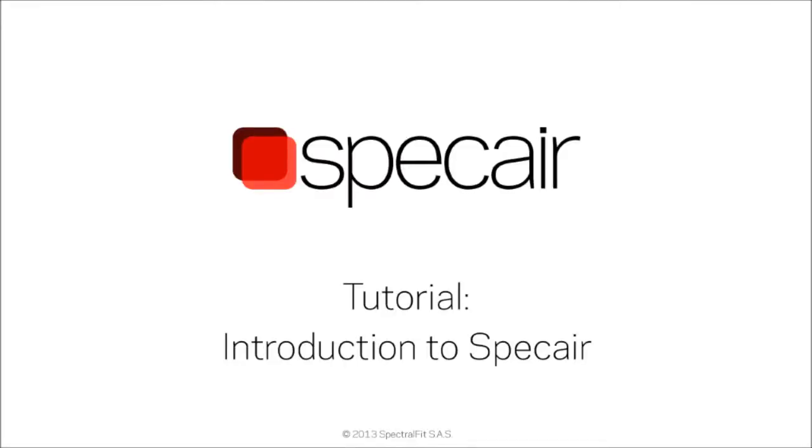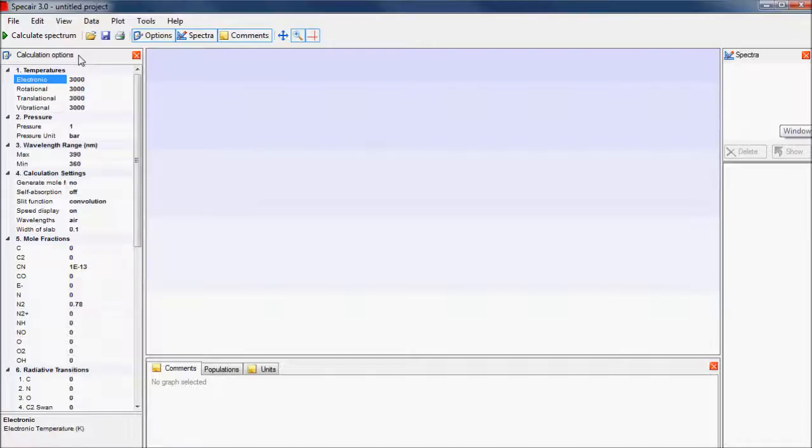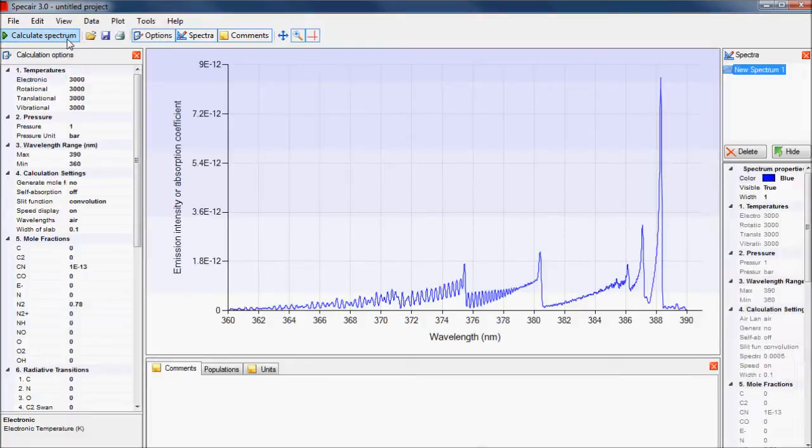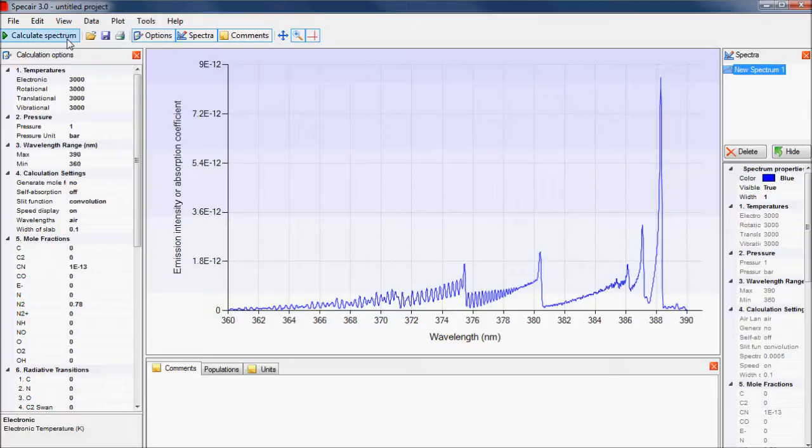This is an introduction to SpecAir, a leading software for analyzing plasma radiation. SpecAir lets you calculate an emission or absorption spectrum by simply clicking a button. Automatic optimizations to experimental spectra can be performed and are explained in other SpecAir tutorials available on the website.